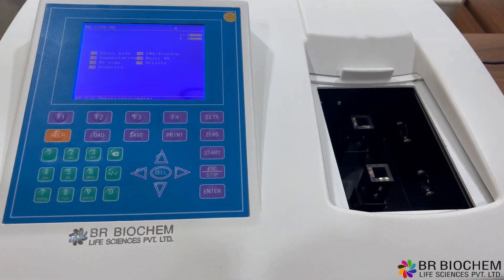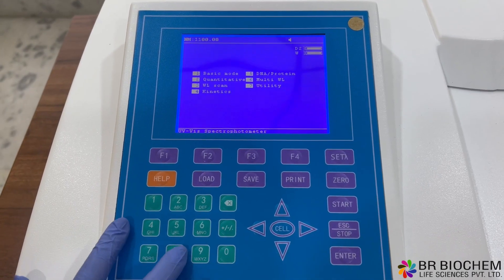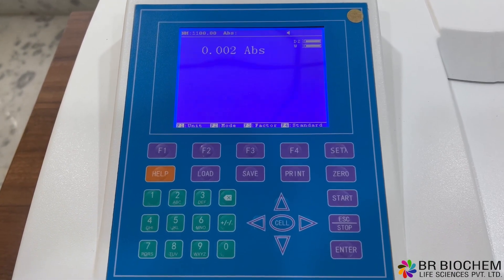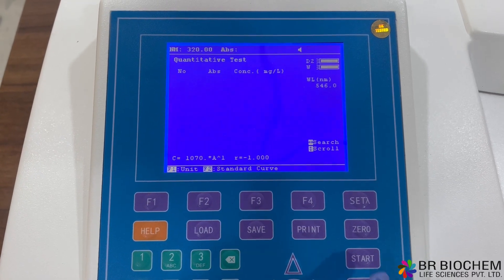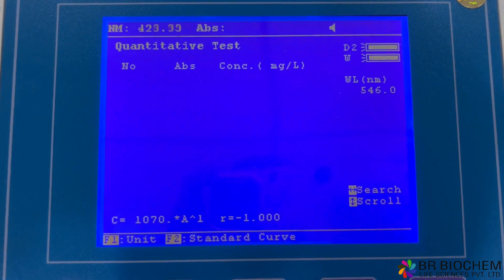The spectrophotometer offers a variety of functions to meet your analytical needs. In the basic mode, you can easily measure the absorbance and transmittance of your samples. For quantitative analysis, the coefficient method and the standard curve method are available, allowing up to 10 standard samples for curve fitting.